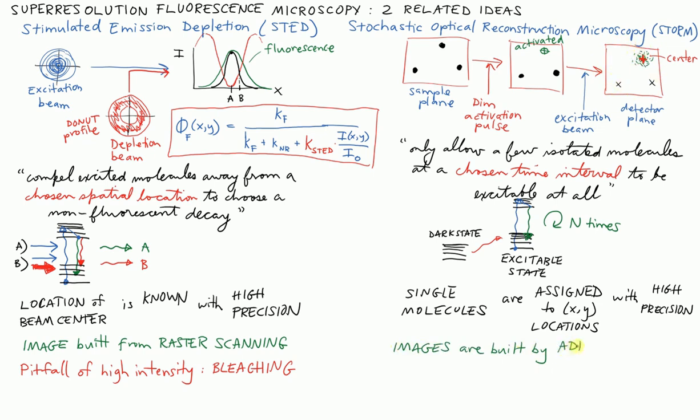So if you add together many sparse images, you then build up a composite image with lots and lots of plus signs in it, and all those plus signs together will tell you where all the molecules in the image are, and that's what forms the fluorescent image that you wanted with molecular resolution for each one of the crosses. And you can then get images that beat the diffraction limit because you're no longer constrained by diffraction in assigning where the molecules are.